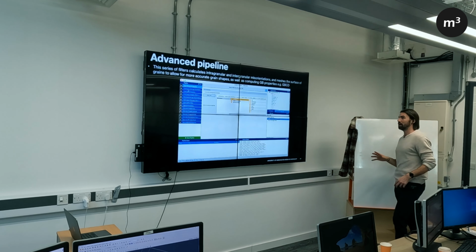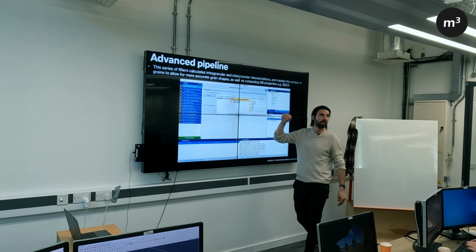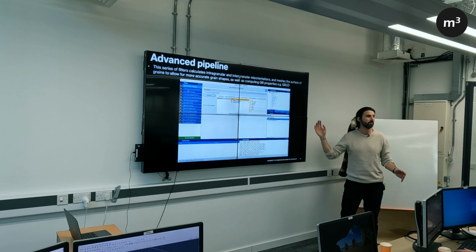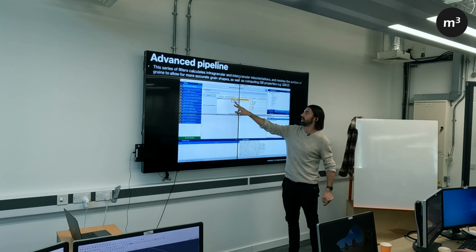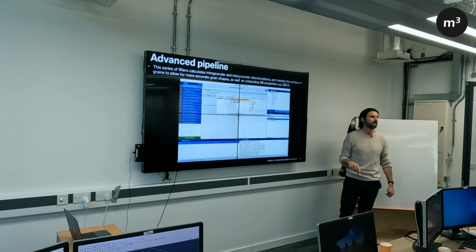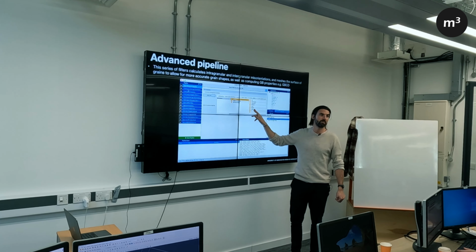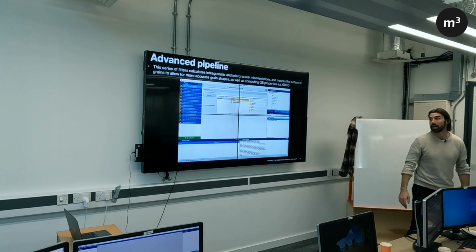So once you've got a data set you're happy with, you can use this filter, read Dream 3D data file, and that will read your .dream3d back into Dream 3D, and then you can do a load of other stuff with it. So again, you'll see your standard data structure when you read it in. So all of your cell data and your feature data and your ensemble data are all there. Again, if you're really worried you've got a 30, 40 gig data set at this stage, and you want to cut it down, and you know you're not going to use some of these attribute matrices, you can untick them and get rid of them to reduce your data size.